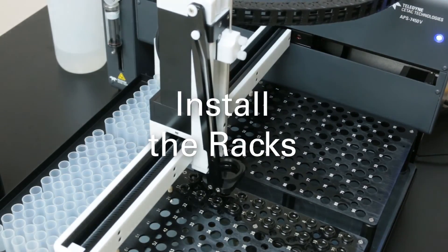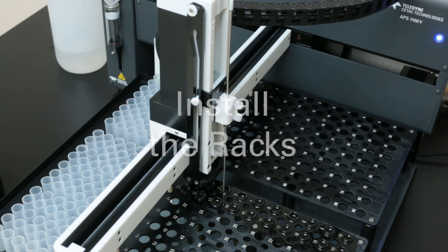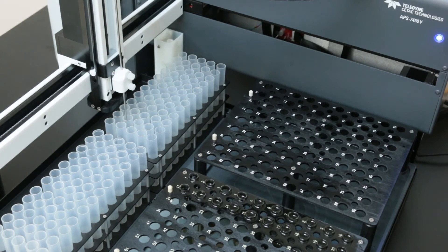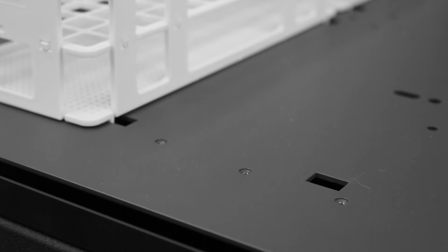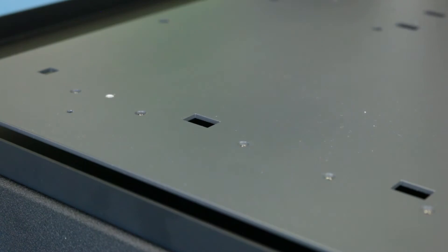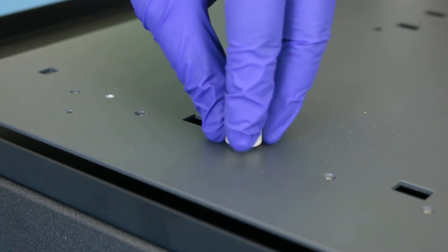Install the racks. You'll always need at least two racks: one rack for sample tubes and another rack for dilution tubes. Some racks have legs or pins which fit into holes in the tray. Other racks are held in place by pins which you need to install in the tray.